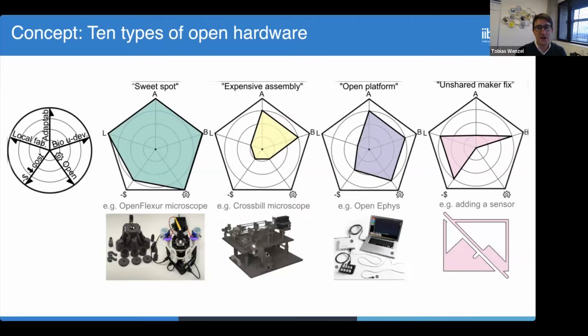So this might still cost tens of thousands to millions of dollars, all the components, and none of these components is open source or possible to digitally fabricate normally. So very poor open source performance. Sometimes they have software that they share openly. You cannot make any of it locally. So this is not accessible globally. This is only accessible in high resource settings.